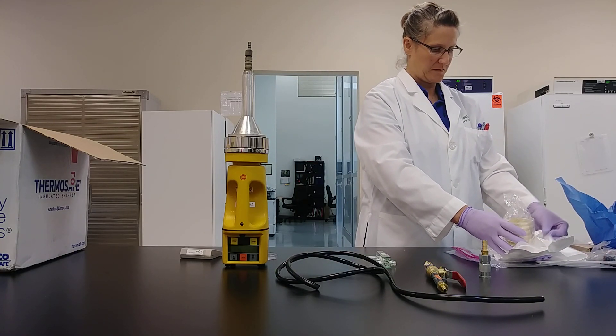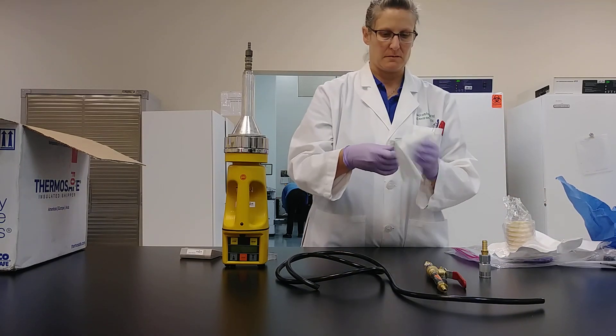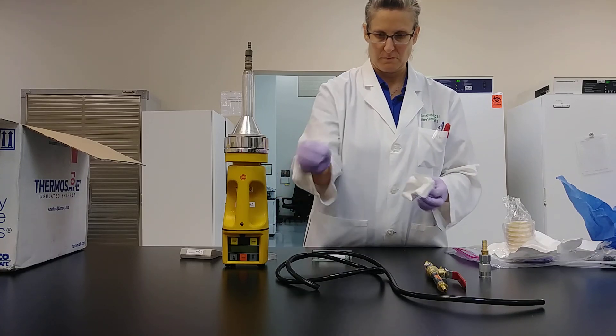Your next step is to wipe the port of the flow meter as well as the ends of the connector tubing with a lint-free wipe that has been sprayed with some IPA.